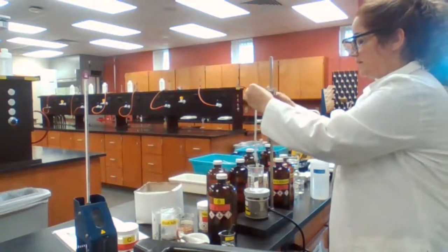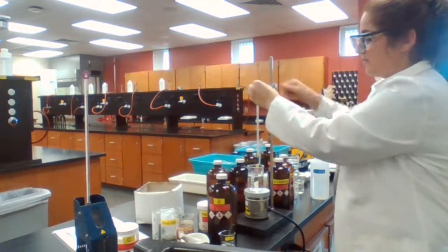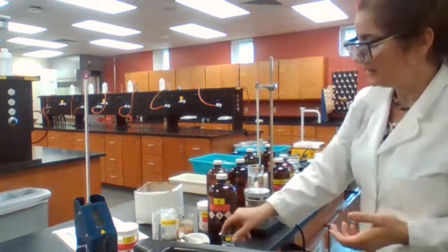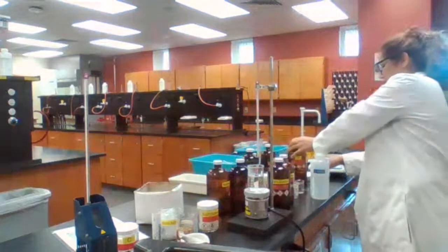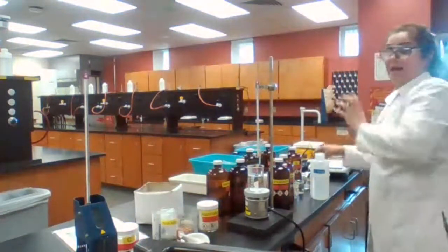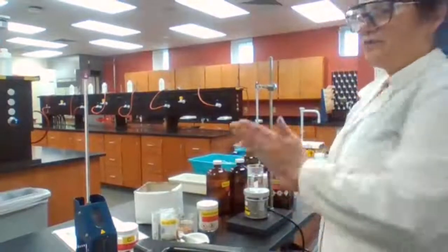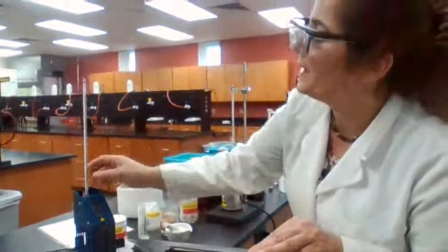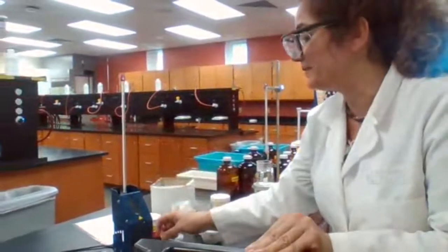Why am I taking half of the heat? I don't want it to boil the sample. If I'm going to get all the vapor in my face, there's no need to inhale more of these chemicals than you really have to. Okay, I'm sorry for going back and forth, but it was perfect timing because now the temperature here is about 65, perfect for our sample.